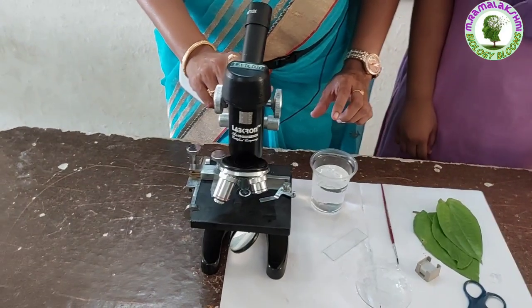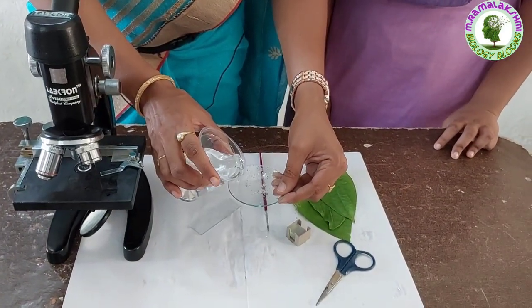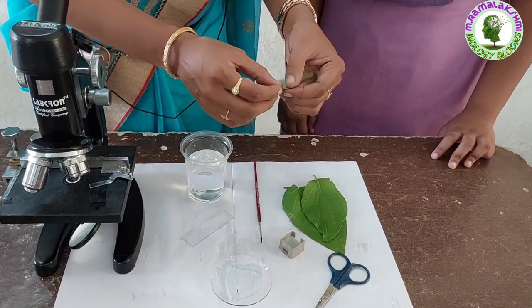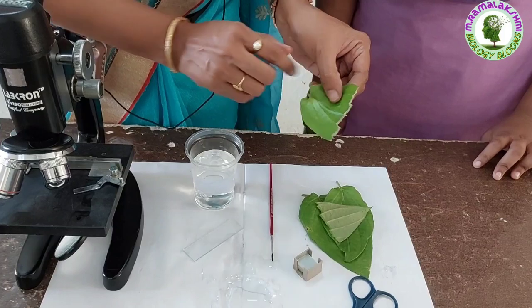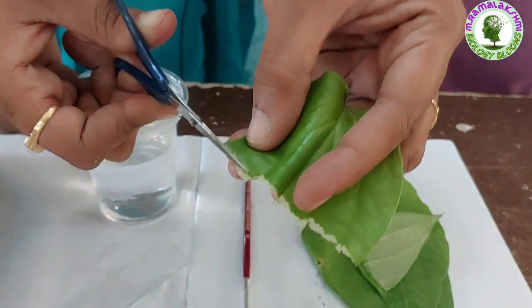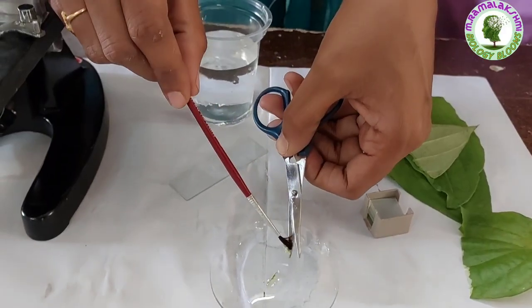And a microscope. First, we take some water in the watch glass. Now take a betel leaf and tear it in a single stroke. Cut a small piece of leaf peel with the light colored portion. Put them into the watch glass containing water.